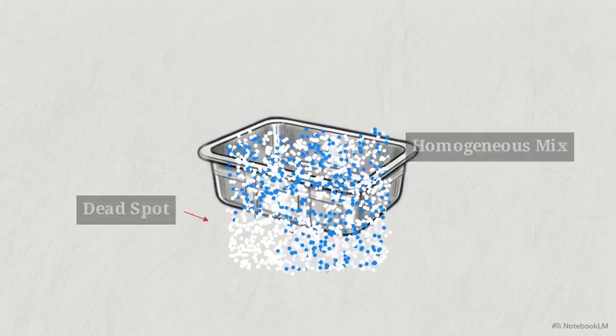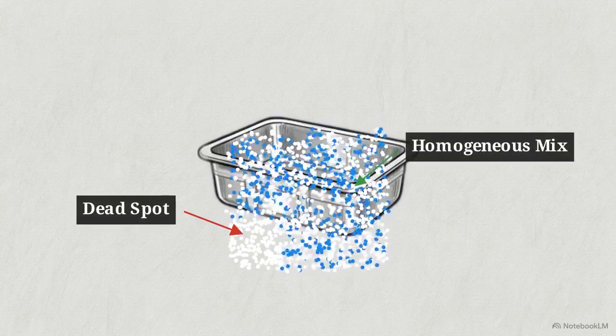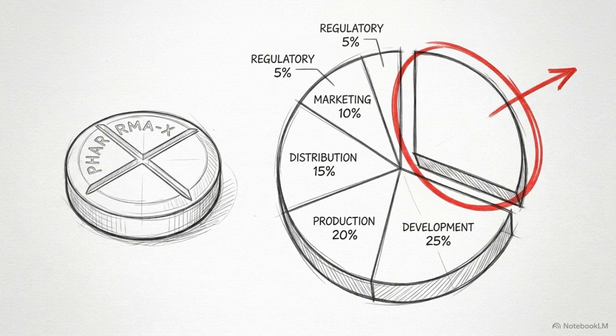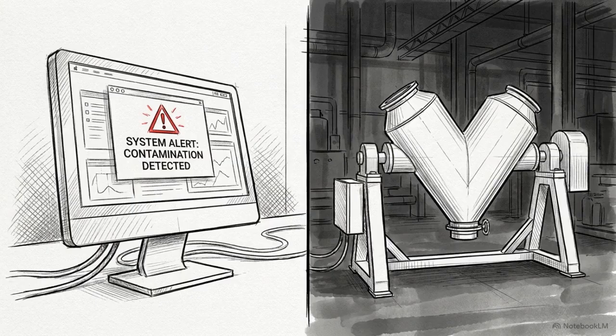Because that corner of powder never fully integrated, the overall batch was non-homogeneous. The active ingredient wasn't evenly distributed, which explains why the final tablet we tested only contained 82% of what it should have. The laboratory didn't make a mistake. The test functioned exactly as intended, acting as an early warning system that caught a critical manufacturing defect.